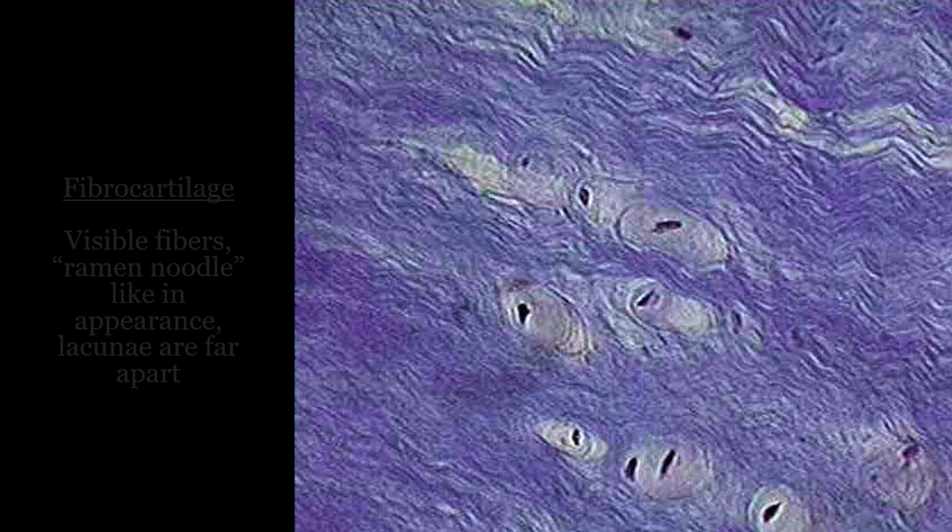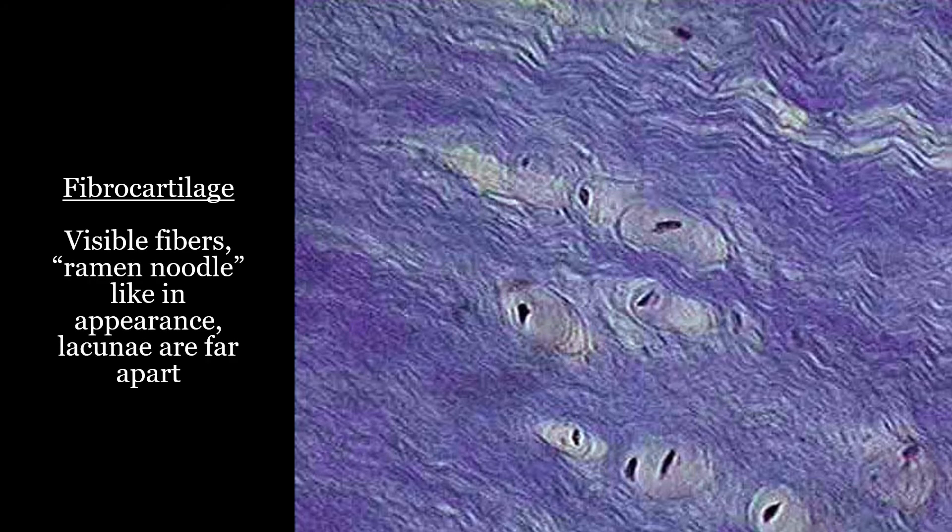Here you're seeing fibers, and the lacunae are kind of far apart — and that's how you know it is fibrocartilage. The fibers in fibrocartilage kind of look more like ramen noodles, if you've ever had ramen noodles.